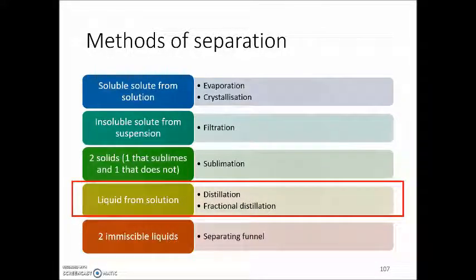Welcome to the final video on separation techniques. So we're going to explore three techniques, or actually two: distillation and fractional distillation, as well as using the separating funnel.